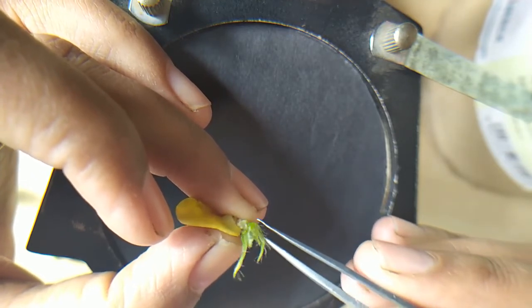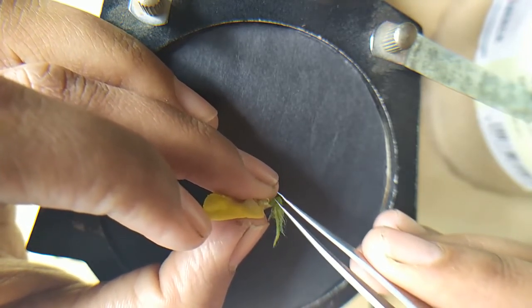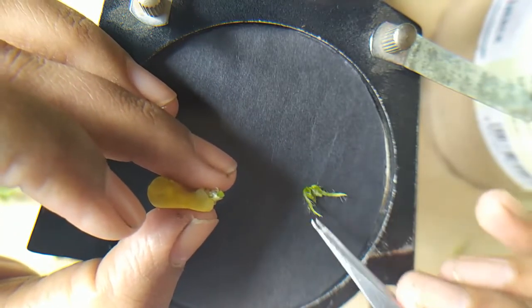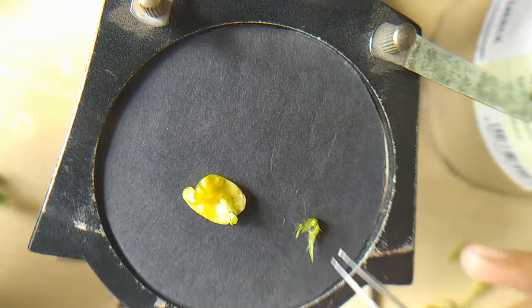The gynoecium is attached to the calyx, so care should be taken that it is free from the base of the gynoecium and the bunch of anthers. If it gets attached, then our 9 plus 1 anthers get missed there. So the calyx, I have removed the calyx here.